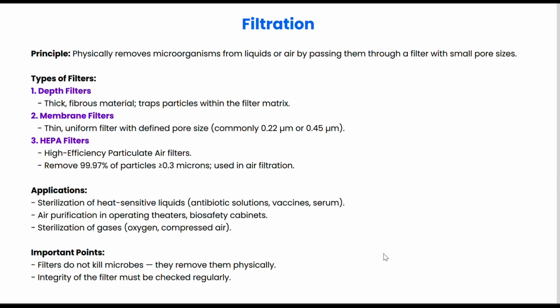Some important points. Remember that filtration does not kill microorganisms, it just removes them from the fluid or air. Regular checking and validation of filters is essential to ensure the sterility.